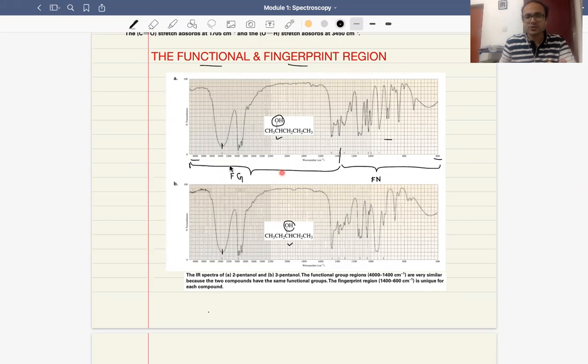number. Okay, so in this you will see a lot of peaks coming in the spectrum, and these peaks correspond to the absorption bands. That means various bonds absorb different frequencies. Depending upon which frequency has been absorbed, that will come as a peak in the spectrum. An important thing to note here is that the different peaks that you see have different levels of intensity. Some of the peaks, like you see here, are kind of weak peaks.